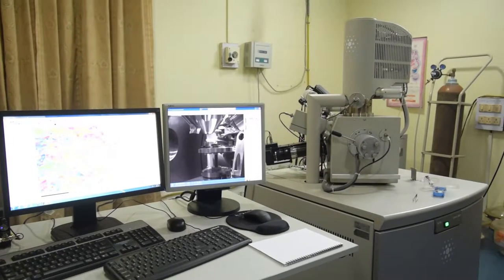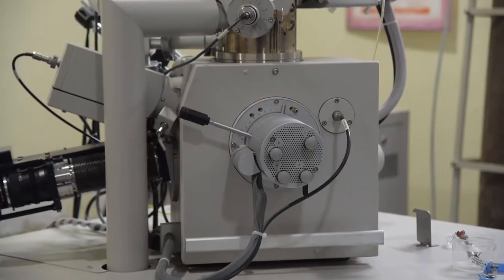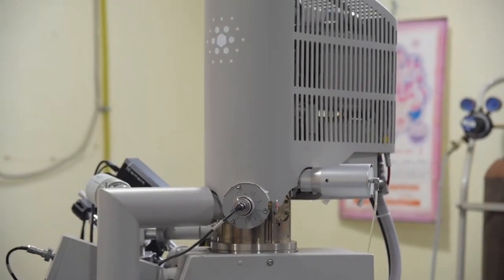This equipment is known as the scanning electron microscope. Previously we were having a LaB6 source; there are many sources. This is a FEG source — a field emission gun source — and this is the source of electrons.